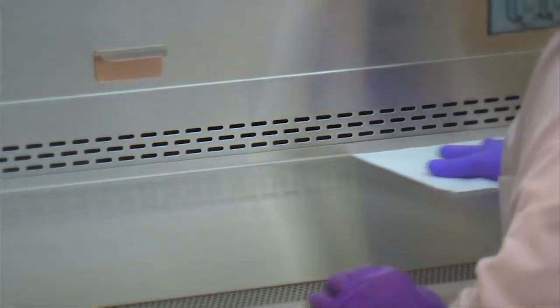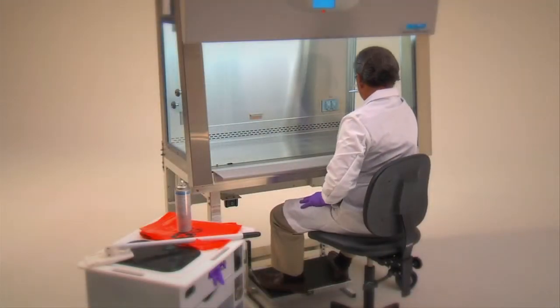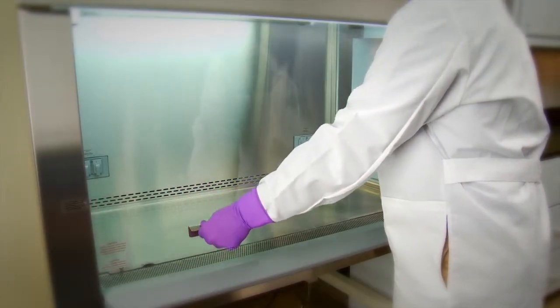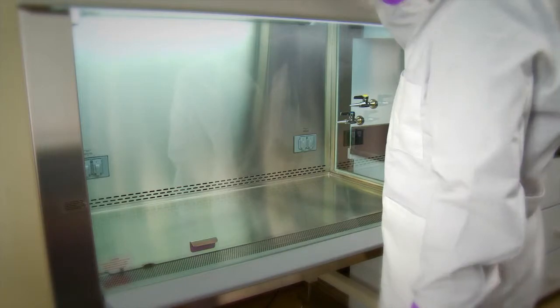If using a chlorine type disinfectant, after contact time wipe down interior surfaces with a seventy percent alcohol solution to protect stainless steel interiors from corrosion. The cabinet can then be turned off and the vertically sliding window closed.